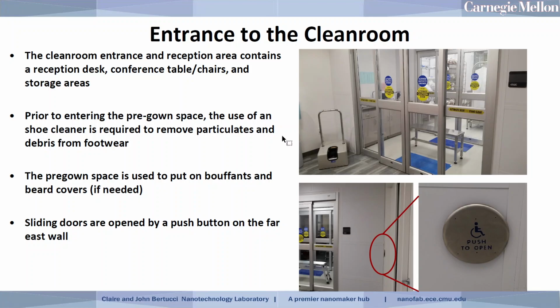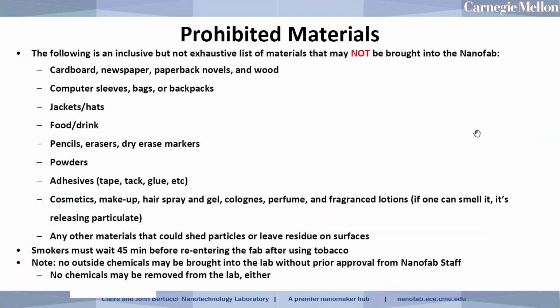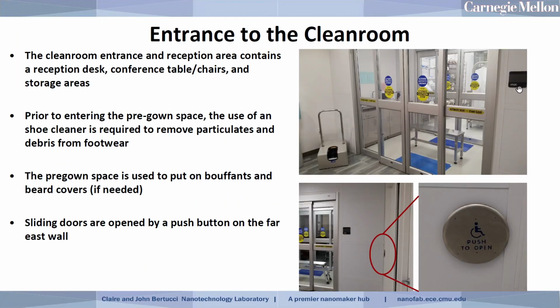Okay. In the pre-gown space, we also put on bouffant caps and beard covers if they're needed. So if users have more than a couple days of facial hair growth, we would ask that they wear the beard cover in addition to the bouffant cap. And these are located in dispensers on this wall right here.